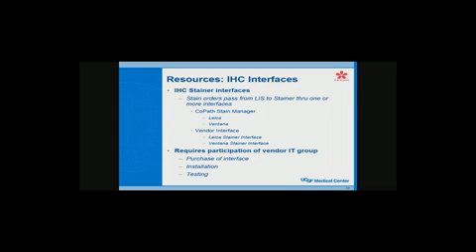Then your instrument interfaces. This is probably one of the greatest benefits of the barcoding, besides tracking specimens and reducing errors. What we do now is, when a stain order comes in and they scan a block to cut it, any immunostains at that time are sent right to the stainer, and then the label that's put on the slide is read by the stainer.